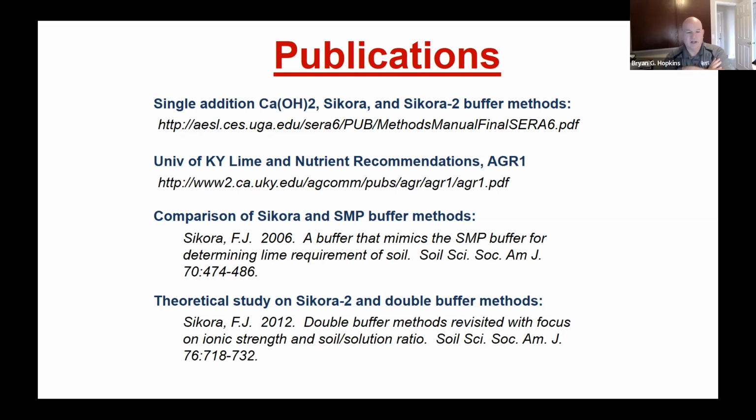Hey, Frank, this is Brian Hopkins. Not a question, just a comment that Sikora actually has a little bit better precision than SMP when we measure it across laboratories. That and Woodruff came out on top in terms of precision. I thought I'd just mention that to you. Happy to share that information with you. Yeah, thanks. I didn't know that.